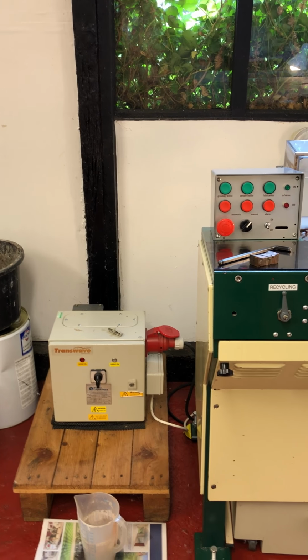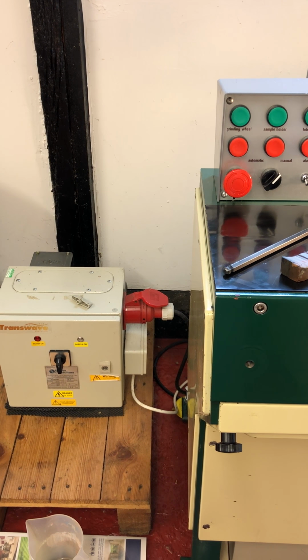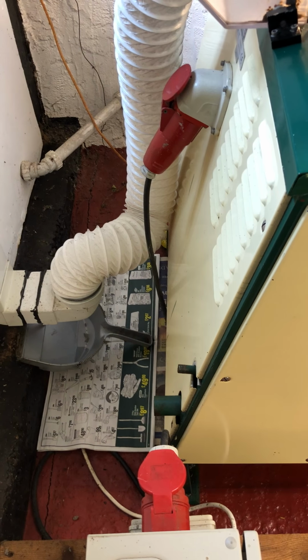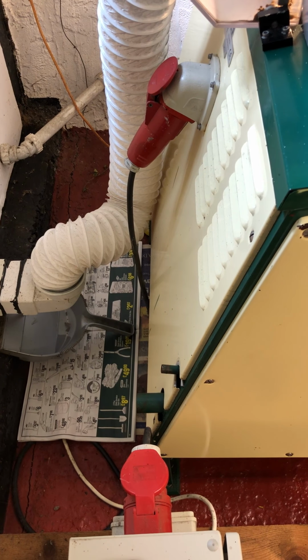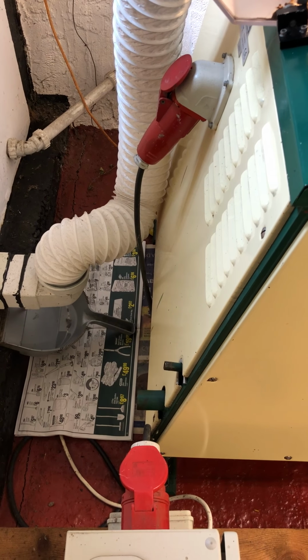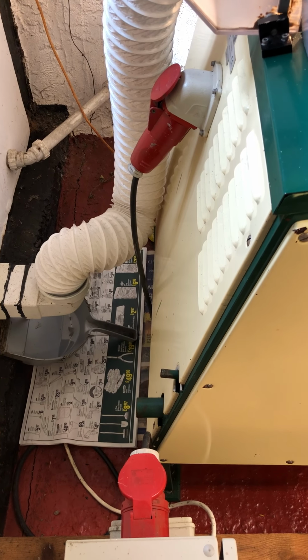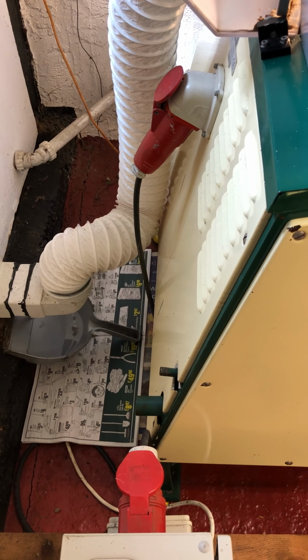Now, the little converter takes that charge, and you look at the big red safety couple there. That line takes it from the converter to the back of the machine, and you can see the two paired up there. We need triple phase because that really runs the machine more smoothly when we're grinding multiple samples and creating friction. 400 volts runs that operation much more smoothly than a 220 line would.